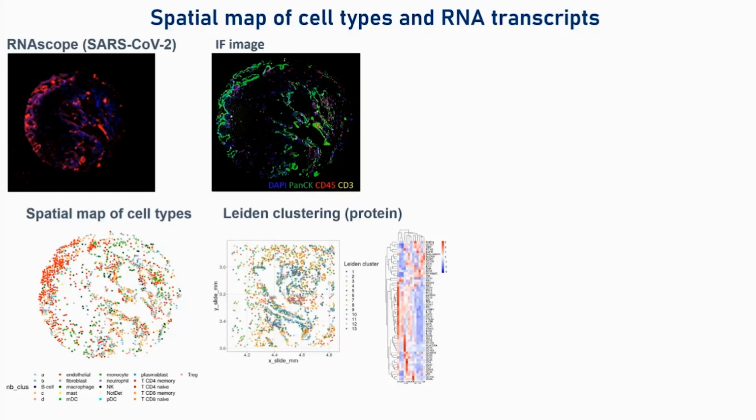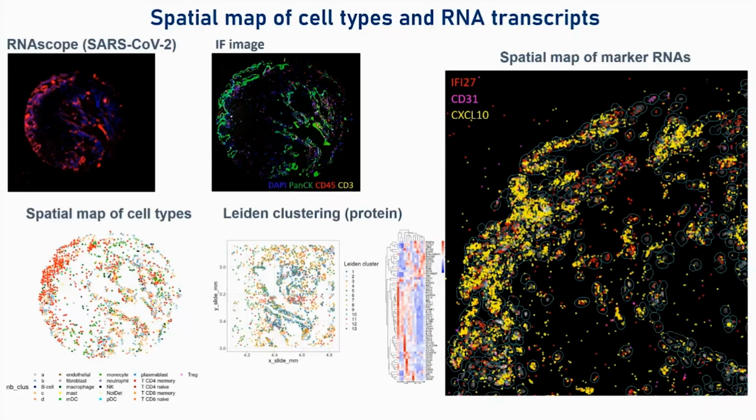You are using a 1,000 transcript readout. So when we have consensus across the cell annotation algorithms, that's when we call these cell types. But what was really interesting is we can now look at individual transcripts within individual cells. And this is looking at 3 transcripts out of 1,000 within those tissues. This is taking that border and just looking at it under the microscope using the SMI technology, and we can start to map the transcripts in space. And so what you can see in yellow is CXCL10, IFI27 in red, and CD31 in the purple. And this is that border that you can see at the top left of each of these whole cores.